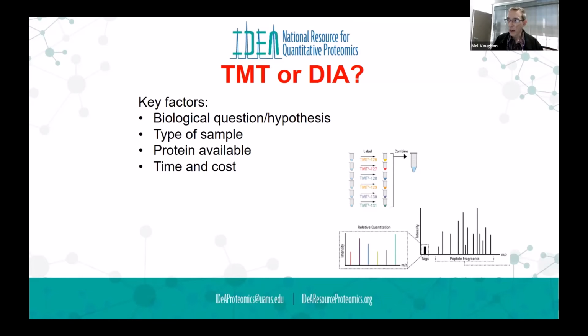So what I want to do is compare the response of these cells in an unaged condition versus an aged condition in the presence of the mechanical tension. And in order to get them in this model, they have to be encased within an extracellular matrix. So a number of questions I would have is, what's the minimum number of cells I would need in the different treatments, and how to prepare the tissue or the cells, like I mentioned earlier. Sometimes I just collagenase the tissue and spin down the cells. But where would I go from that point?